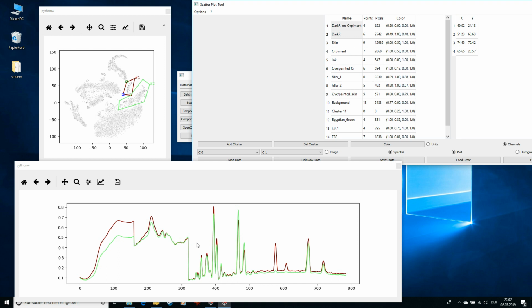First derivative we have the same features, but that indeed we have in the red curve here a signal for arsenic. You see down here they are actually just the channel numbers and not the units. This is because the dataset was made with a much earlier version of the data handler P.